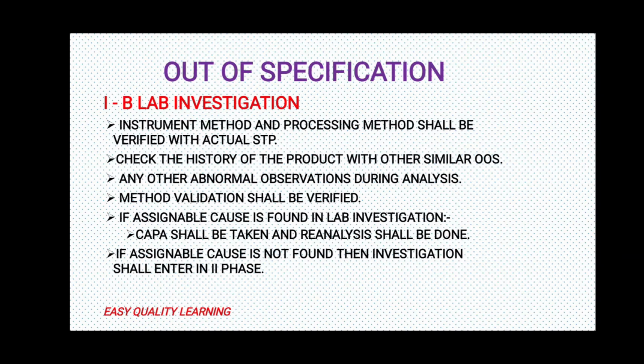Method validation shall be verified. We need to check the method validation, that how the method was behaving during the validation, and whether there is any change from the method validation, or whatever we are routinely getting, that also we need to check.